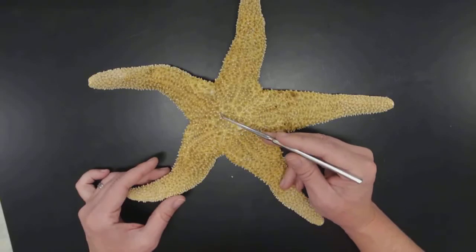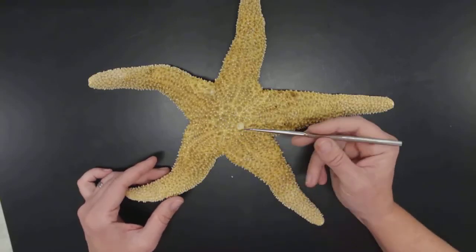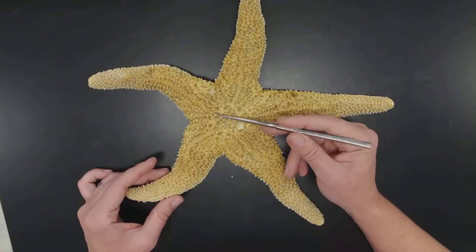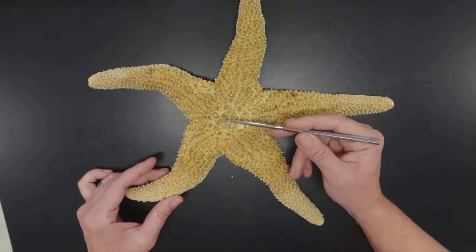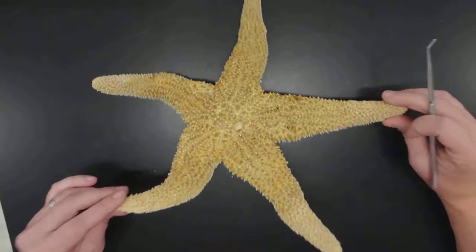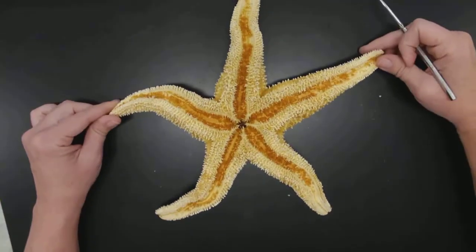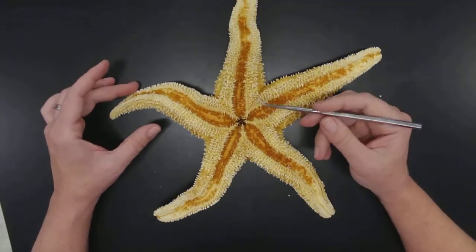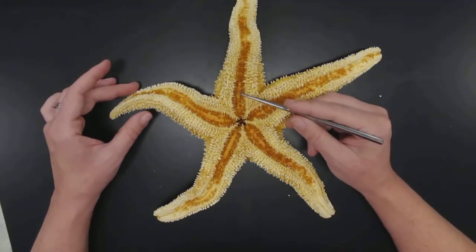I really can't see the anus — I'd have to get under a dissecting microscope to find it. Maybe there? It's very unclear. If I turn this specimen over — okay, it's dry and a little bit brittle.